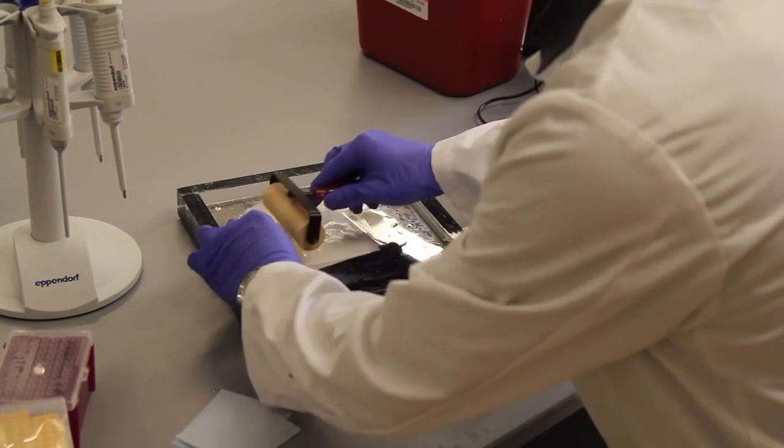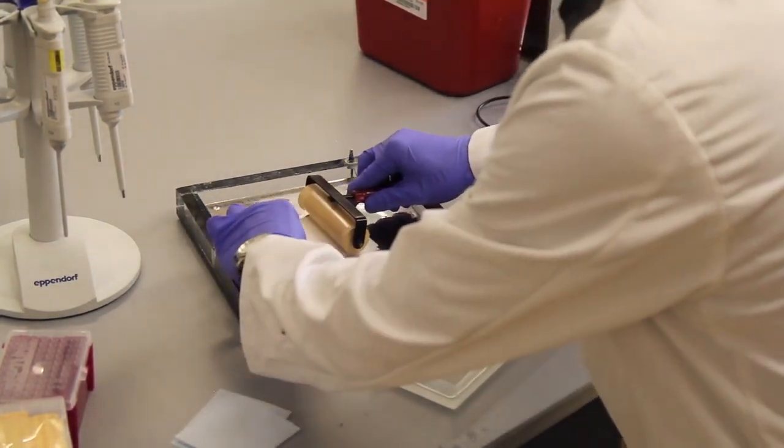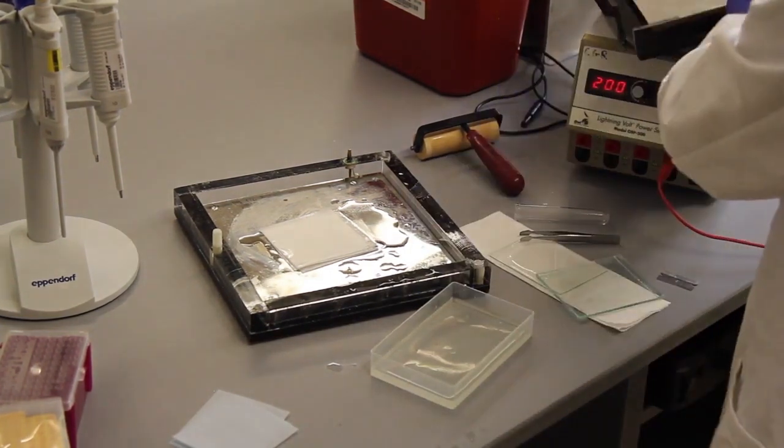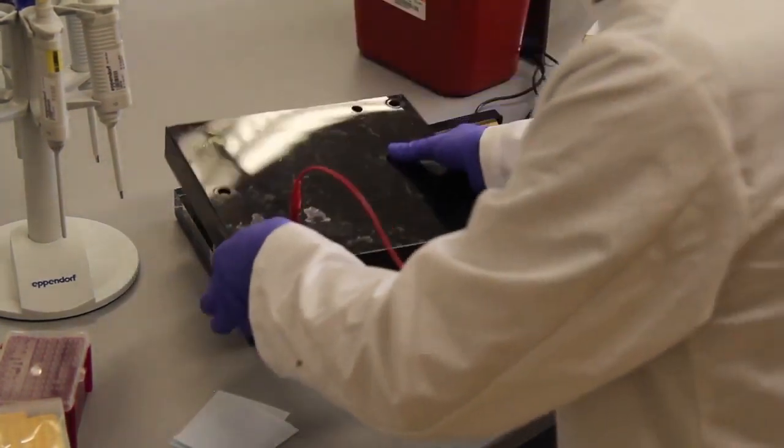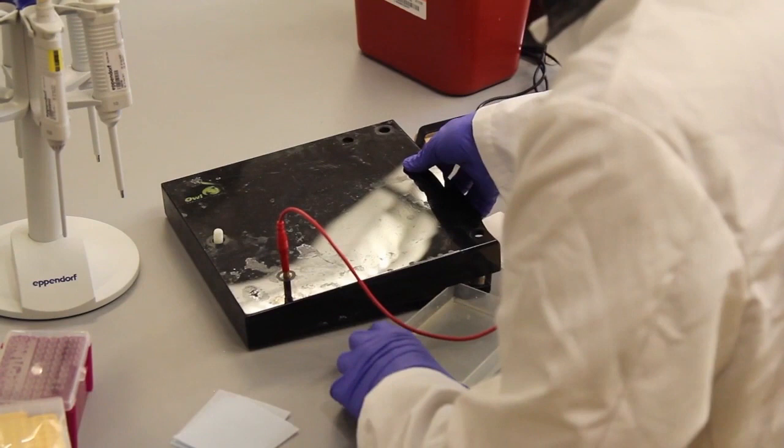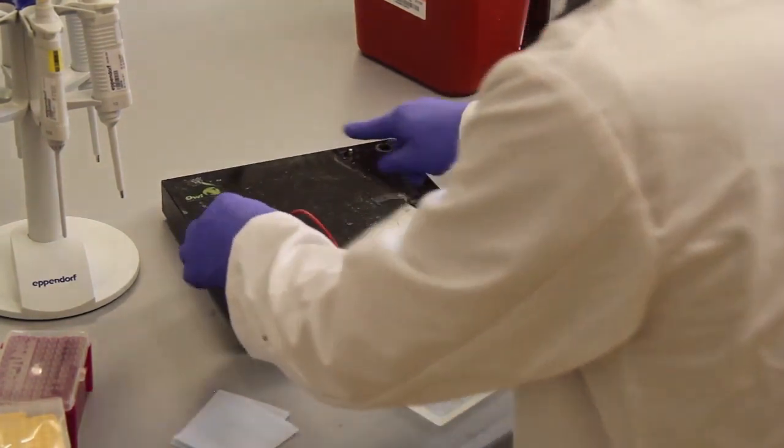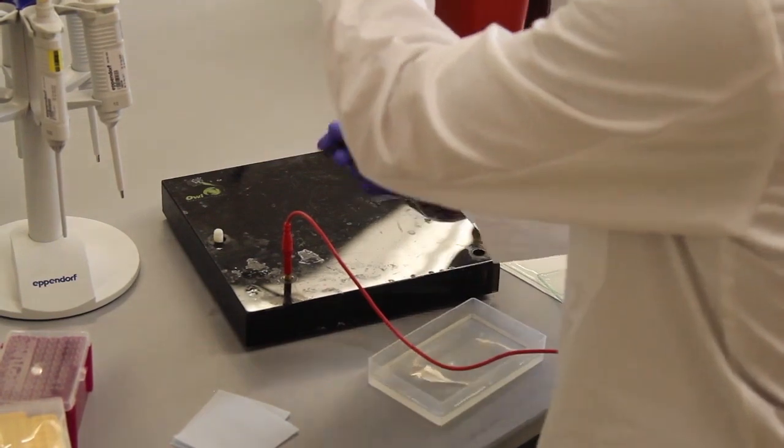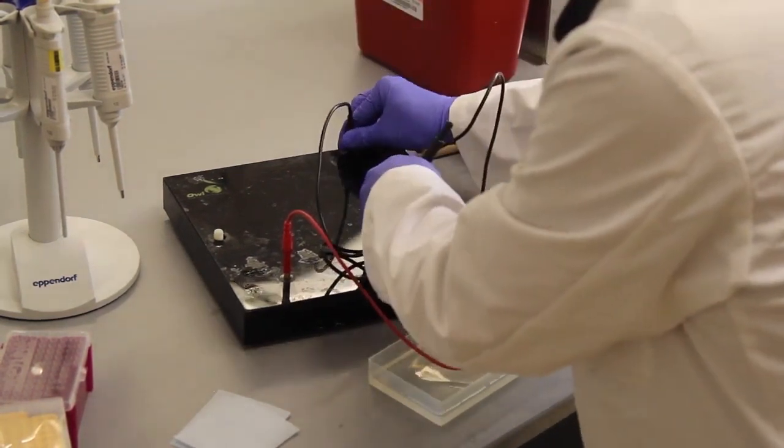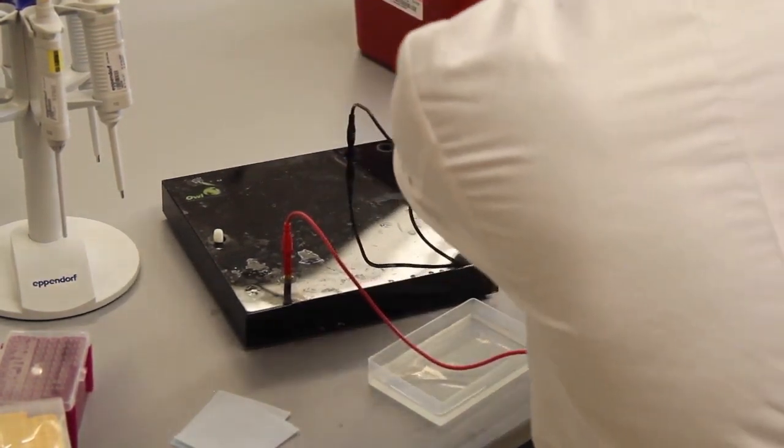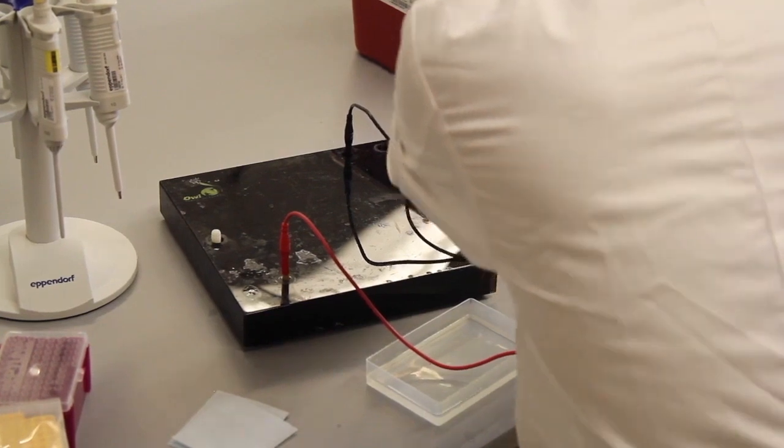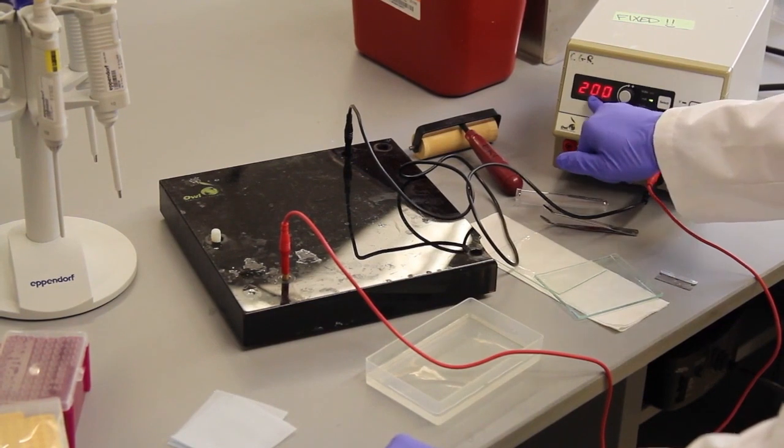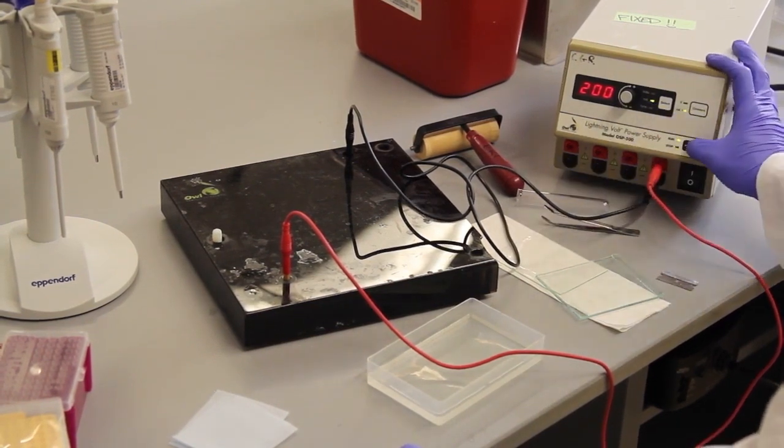Okay, now that it's all assembled, I'm going to flatten everything again to make sure all air bubbles are out. Put the lid on. The red electrode is already connected. The black one still needs to be connected. And this is going to run at a constant 200 milliamperes for about one hour.